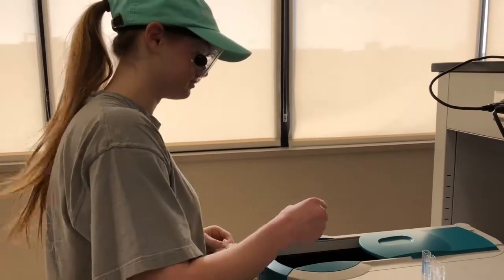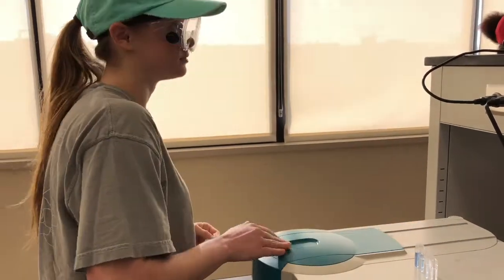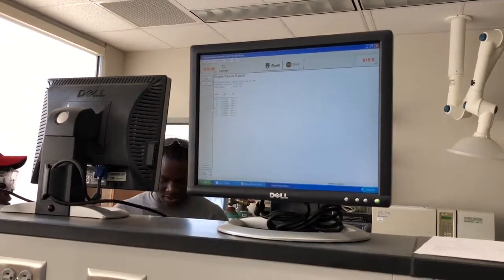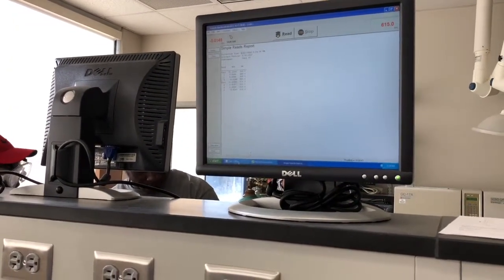Before putting the cuvette in the spectrophotometer, we cleaned 2 sides with a chem wipe. The clean sides were then placed where the light could pass through them and the lid was closed. In order to get the absorbance curve, we then pressed the read button and observed the results.